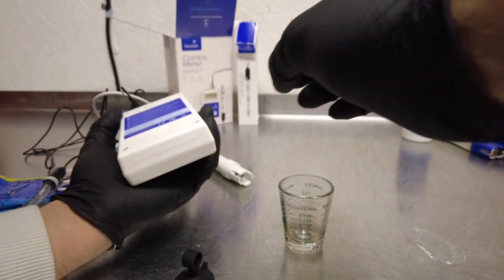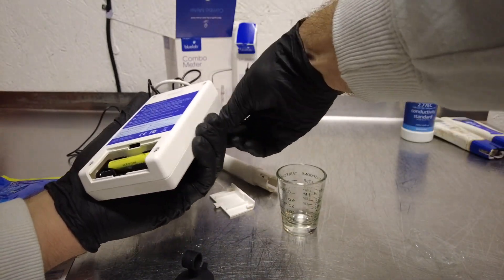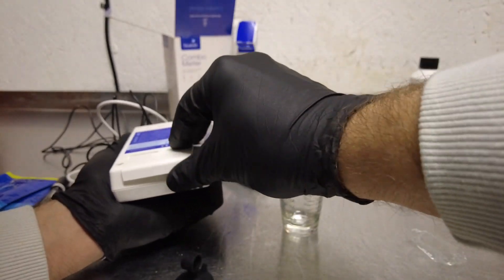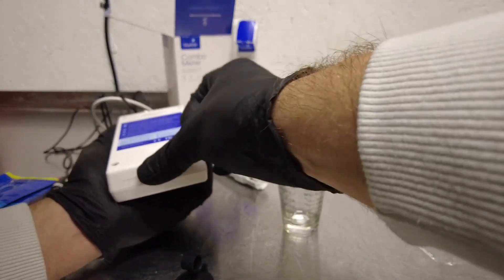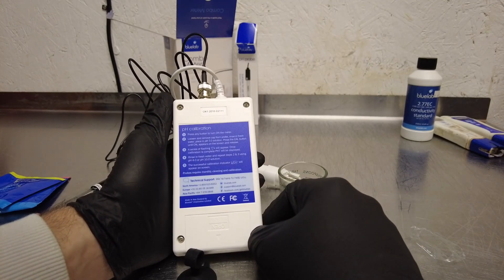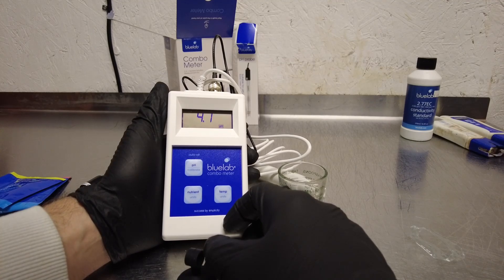We're going to go ahead and calibrate the pH probe so that we know we can use it in our res. I need to install the batteries first — let's pop this open. Thankfully it doesn't require screws. Looking at the back, it actually has your instructions printed right on there — technical support number and everything. pH calibration: press any button to turn on the meter.